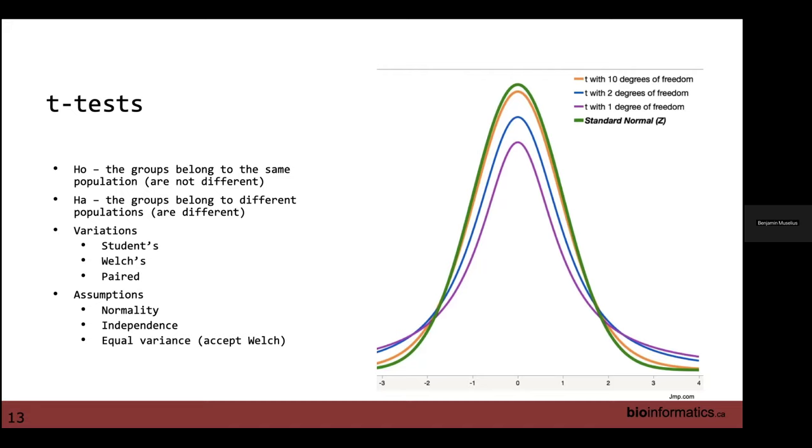If you think about it briefly, we're using the idea of distributions. If you have a single point, that's not a distribution, that's just a point. If you have two, it's just a line. Again, it's just a distance. If you have three, it's not a very good one, but you start to have more information about the distribution you're modeling, at least enough to do a statistical test.